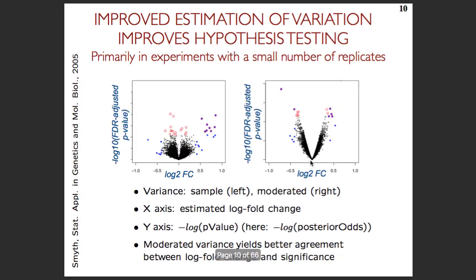And this is something which was very popular in mass spectrometry. What I have seen quite a bit is that people say, oh, okay, LIMMA was designed for microarrays. We have data structures which are similar as microarrays. Therefore, let's go ahead and use LIMMA as is. And I see this even up to date across the board, where people use LIMMA not because it can help with variability, but just because it has similar data structures. And I would like to argue that it's a good thing if you try to address the problem that LIMMA addresses. But it's not necessarily a good thing if the problem in mass spectrometry is elsewhere.